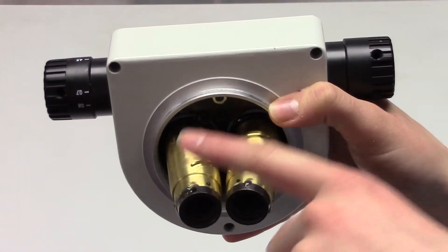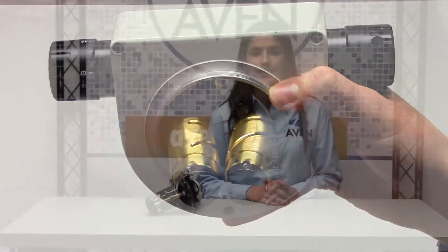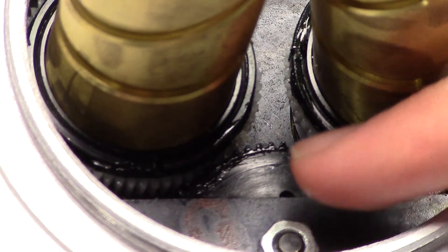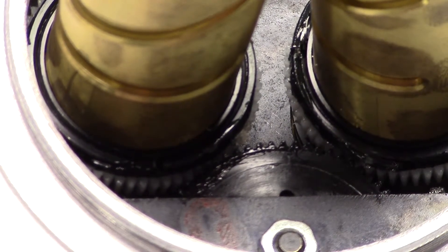Another assembly method is the use of dual barrels, with each objective lens moving independently on a common gear system. This is the least desirable construction method. Dual gear assemblies coupled with loose manufacturing tolerances generally used by manufacturers using this low-cost design can cause double vision. In order to make the gear mechanism operate smoothly, manufacturers use grease on the gears to make up for variances. As the grease begins to break down, the gears will begin to slip, making the lenses come out of alignment and causing double vision.